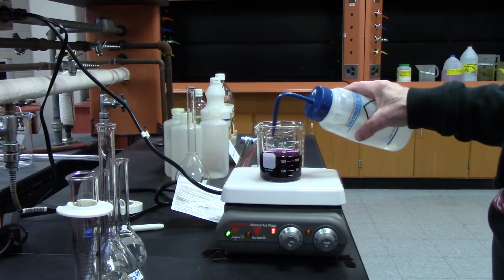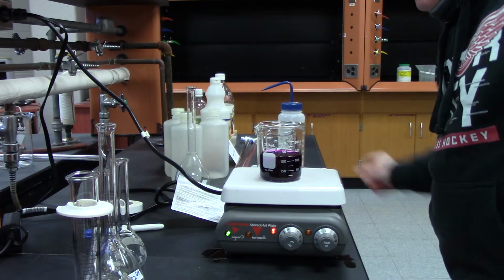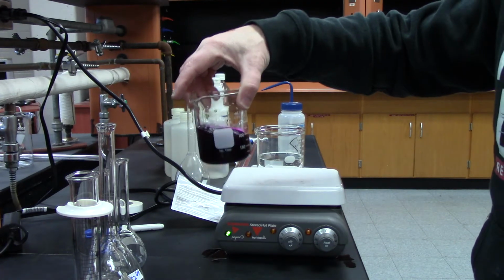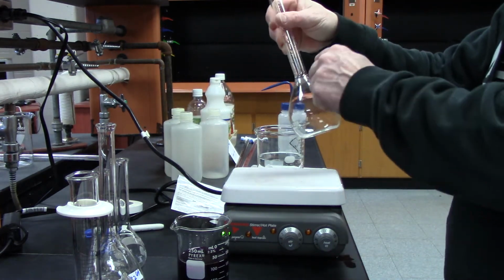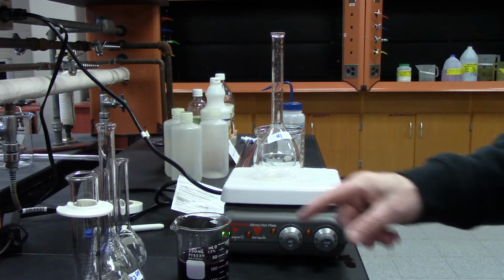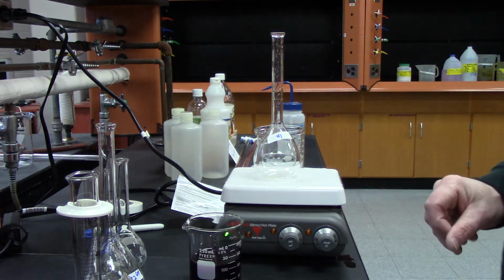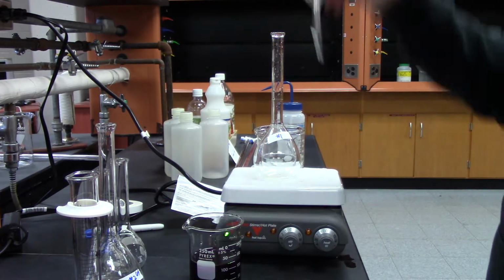So there's a little pink on there. That's fine. Okay, so I'm going to say it's mixed up. So I'm turning off the stir bar, and now I'll continue. Now, this isn't my final destination. Okay, this is my final destination, labeled number 1. So what I'm going to do is add the beaker solution, which is not the correct volume, therefore the right concentration, to my volumetric flask.